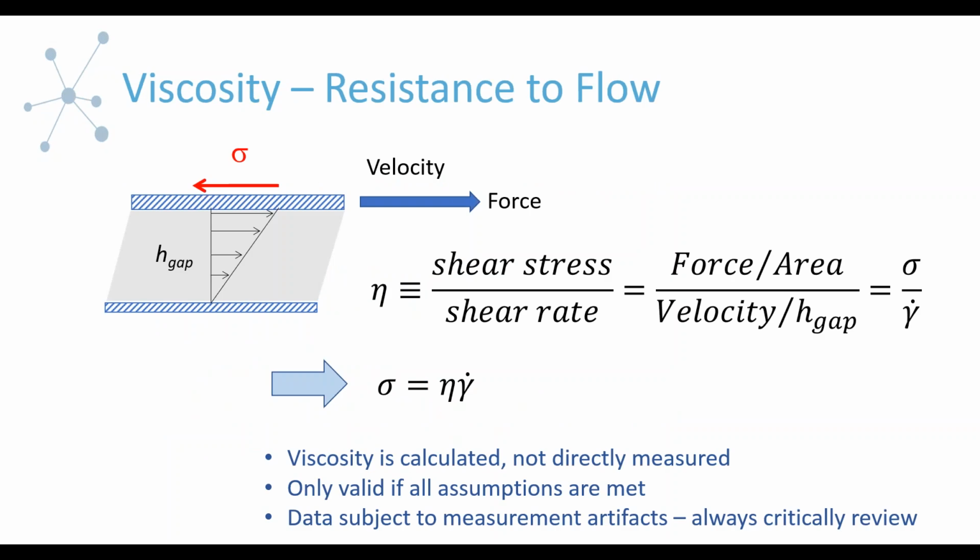Okay, so starting off, just to remind you what viscosity is. Viscosity is going to characterize the resistance to flow, and it's a defined property that's ultimately calculated. So viscosity is shear stress over shear rate. The easiest way to view this, we have a schematic here where we're looking at a fluid between two plates. The lower plate is stationary. We're moving the upper plate at a particular velocity.